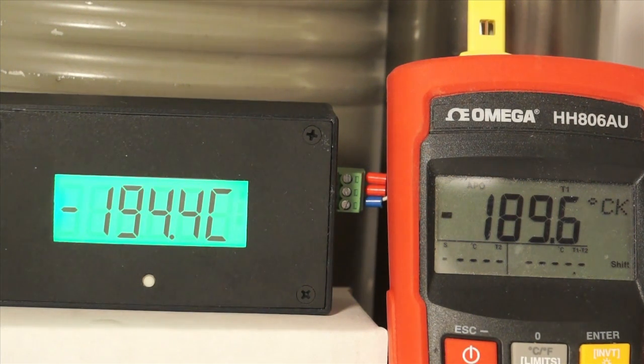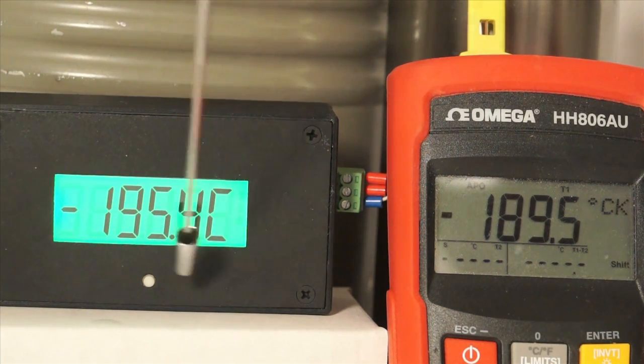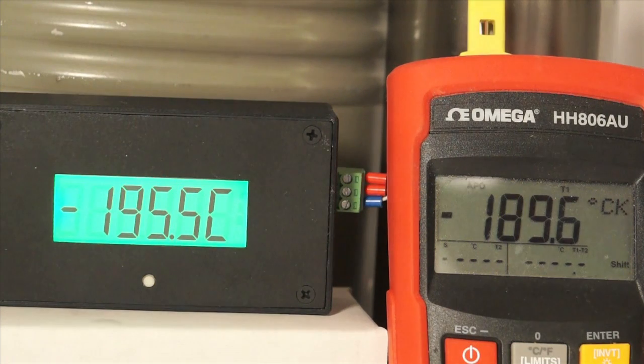Quite a difference considering there is a big difference in the price between both of these units. And there you have it. Highly accurate cryogenic temperatures with the Crybabies.